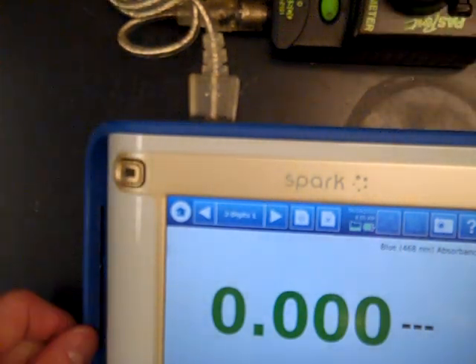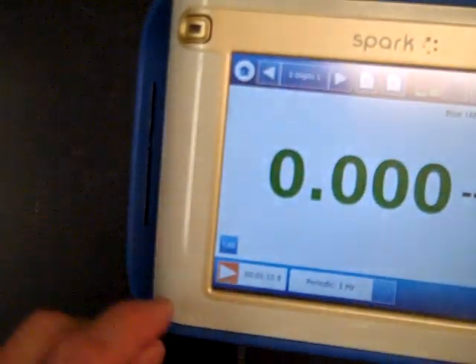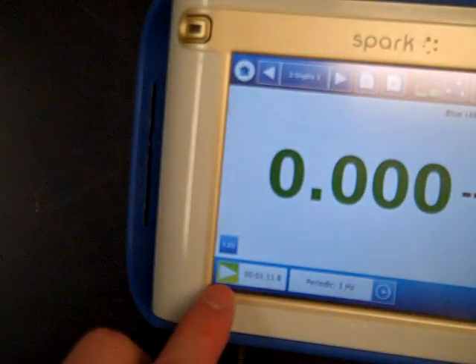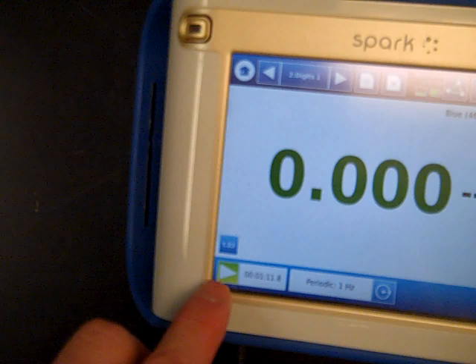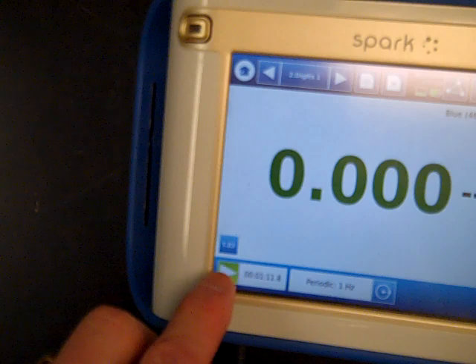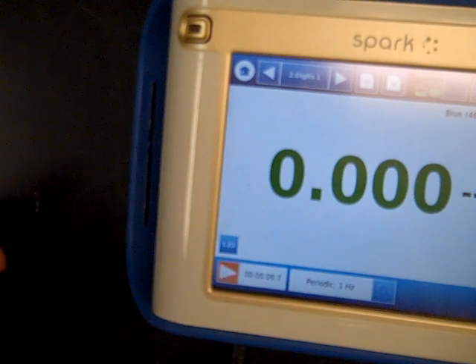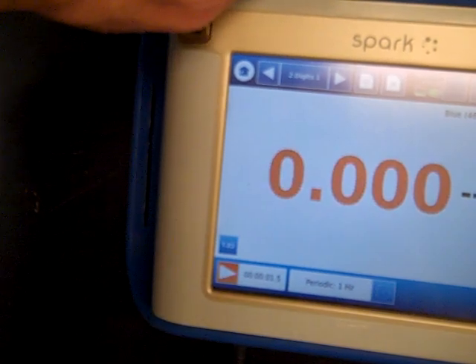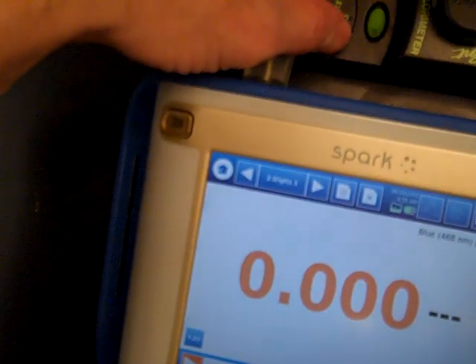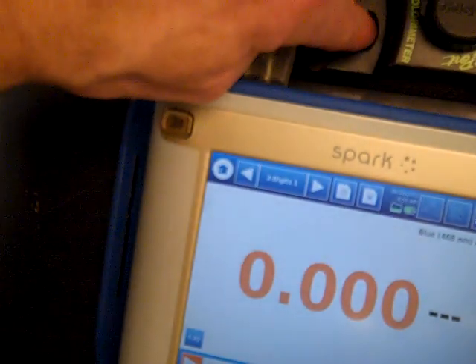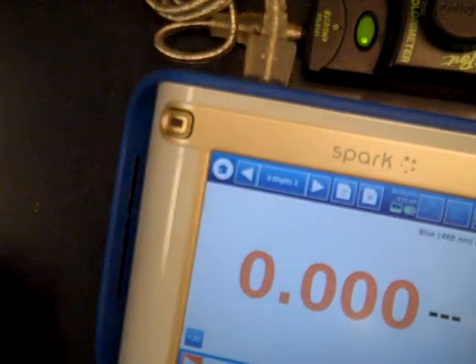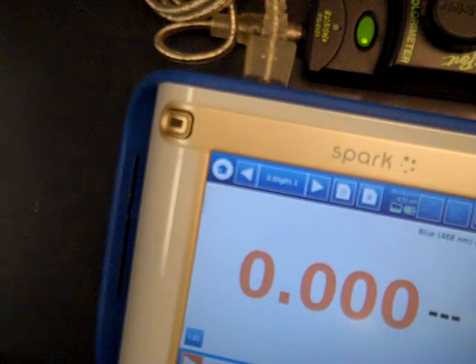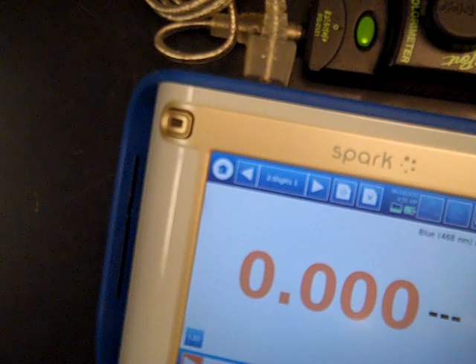Now we press this button down here. Once it goes red, it's reading. Then I press the green button on the colorimeter to indicate that we're running a blank.